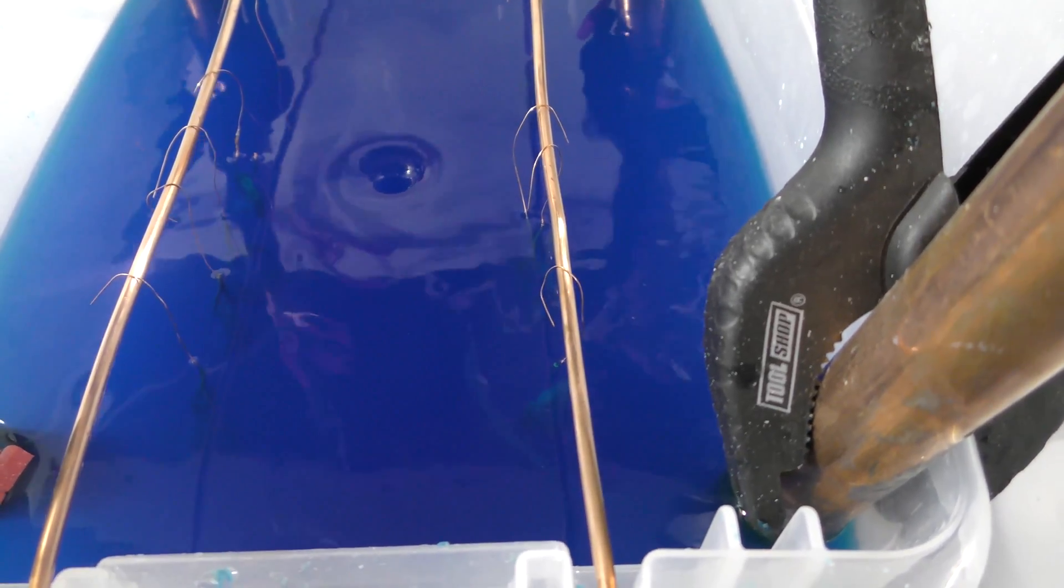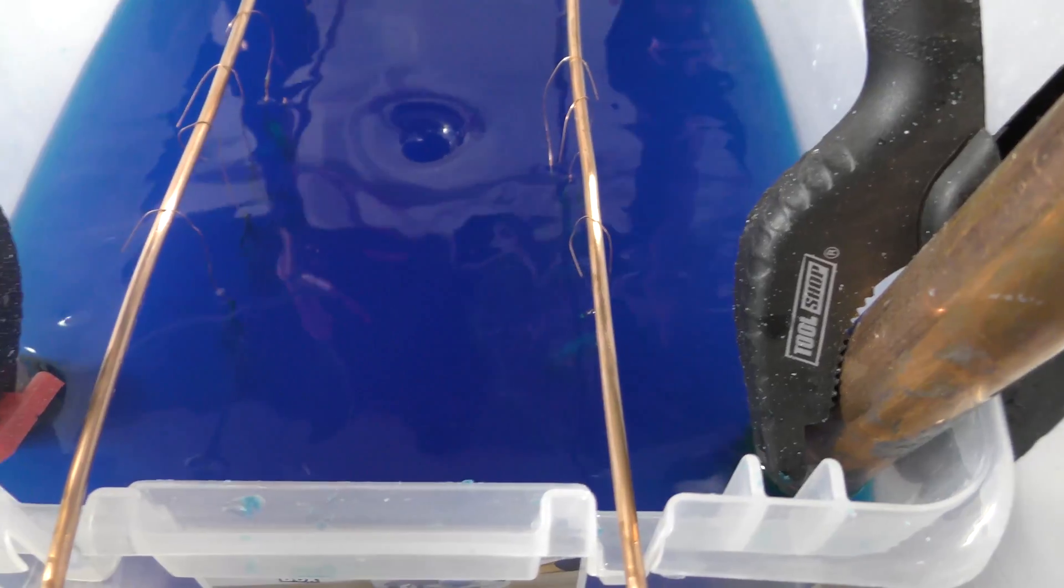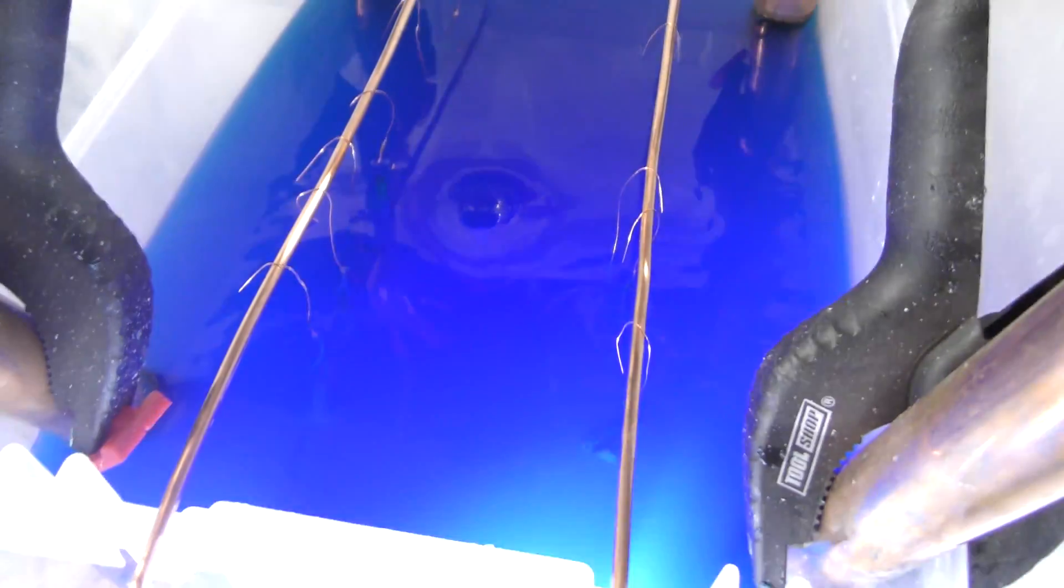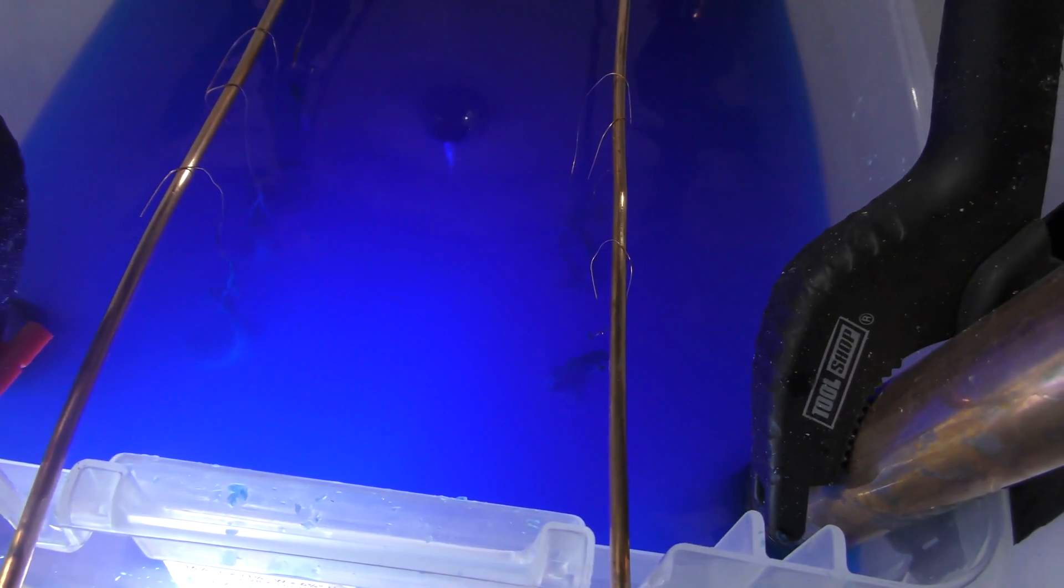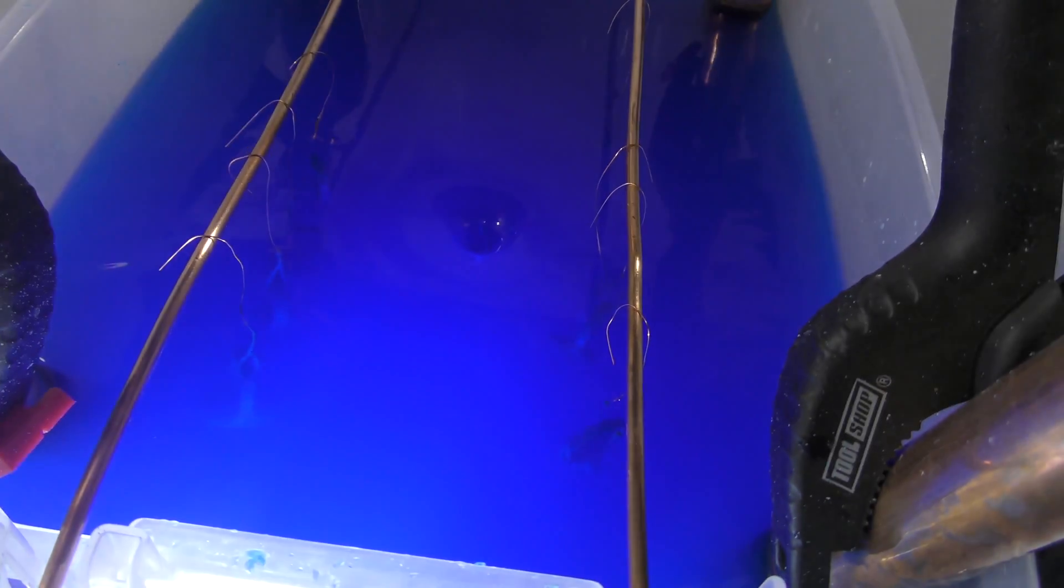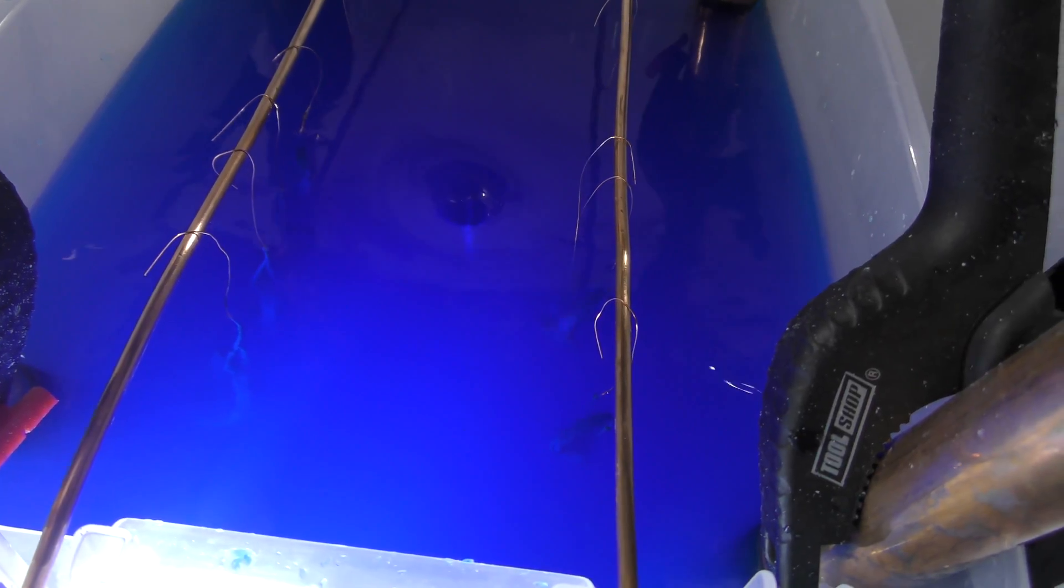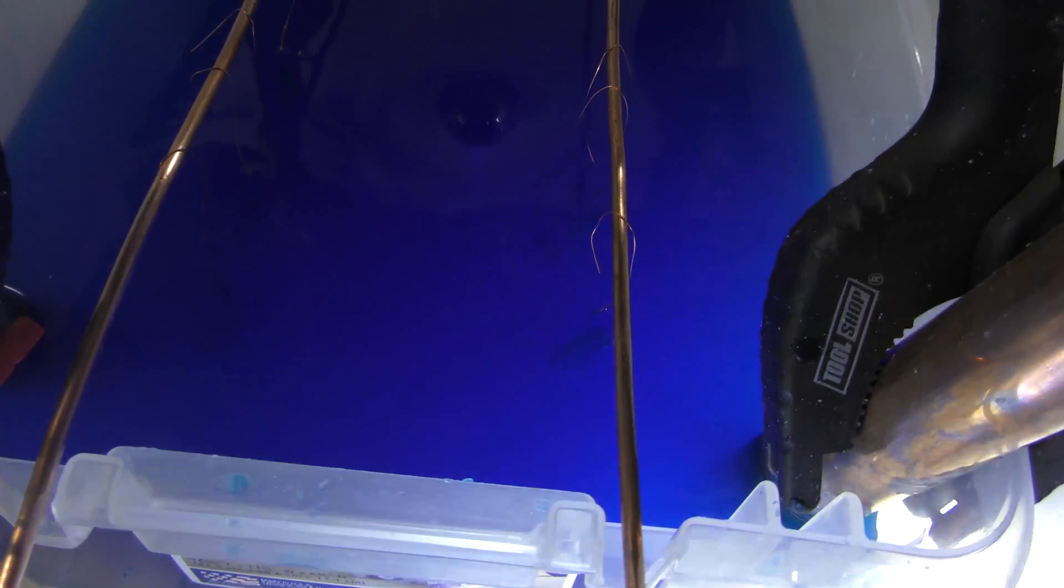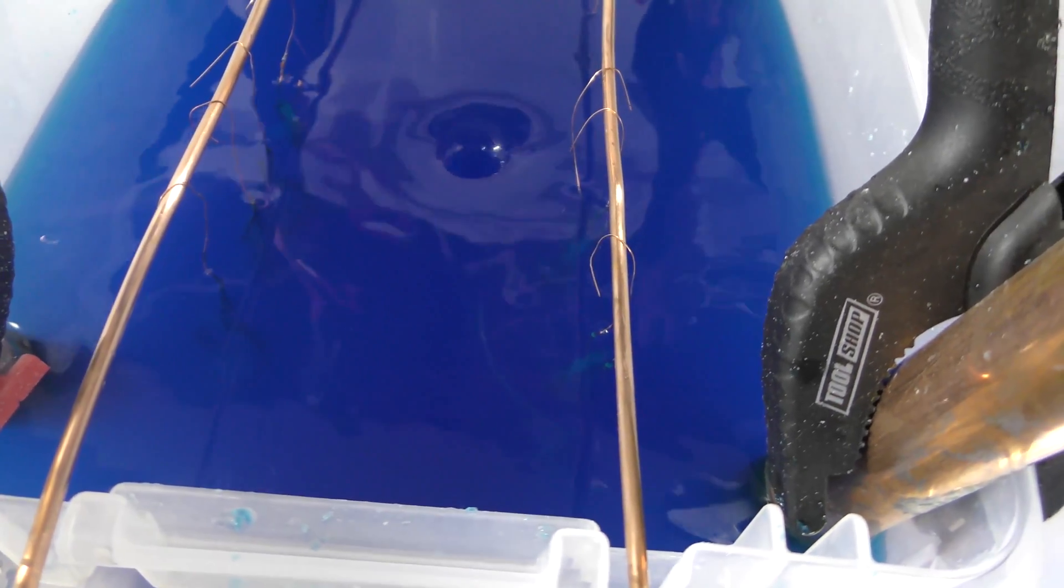This is the two-inch pill. And you can see, I have quite a whirlpool going on. If I put a camera over the top of it, it goes down there maybe a half of an inch of a whirlpool. Let's shine the light on this thing. Show you what's going on with the rings. Oh, they are dancing. And you can see that whirlpool right there. So this brand right here is pretty amazing in the depth of it.